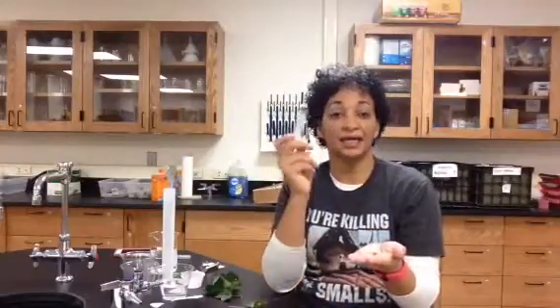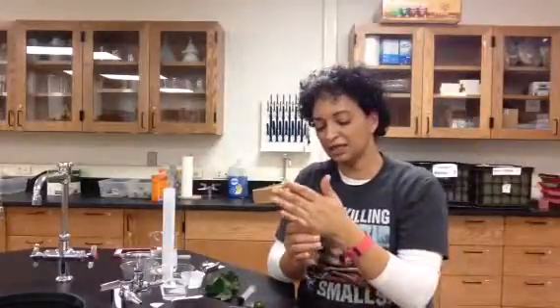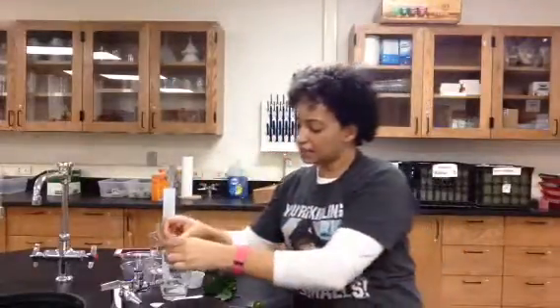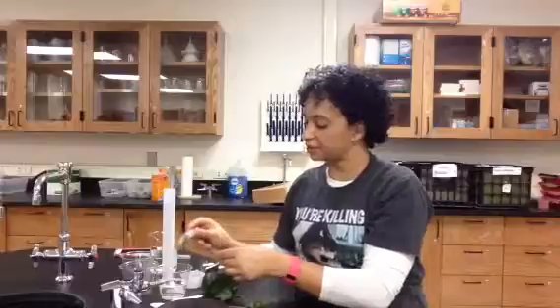Now, if I was to put these leaf chads into water right now, they would float because inside of their air spaces, there's carbon dioxide and oxygen. I need to get that out of there, so I'm going to use my handy dandy syringe. So I'm going to take the plunger part out, and I'm going to put my 10 leaf chads into my syringe. I want to make sure I'm not squishing them when I put the plunger back in there. And then I'm going to go ahead and suck up some of this liquid that I have already put into my cup. Just a little bit. Maybe about 4 milliliters or so.